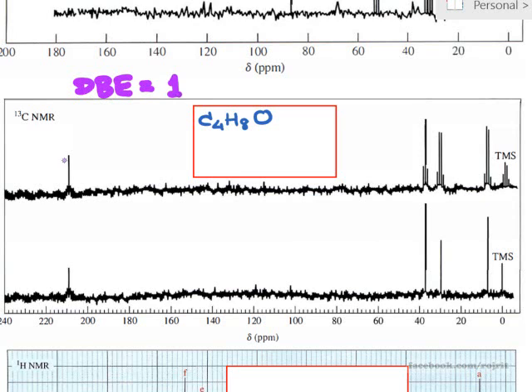And if you look at here, this area is 200 something. So if it is 200 something, comparing with hydrogen NMR, divided by 20, it ends with about 10. So 10 is the aldehyde, right? So this carbon belongs to carbonyl. So we can be sure that this is the carbonyl group. Okay, and as you can see here, it appeared as a singlet, right? So if it appears as a singlet, that means both sides of the carbonyl are connected with carbon atoms.